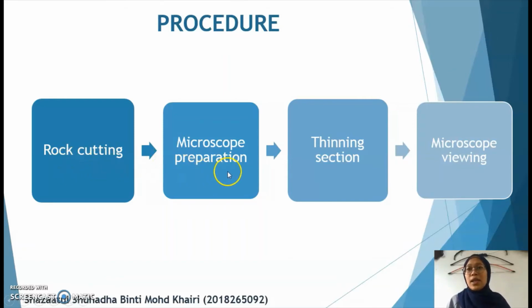And then the second one is preparation of the microscope slide. Basically the rock sample was applied onto the microscope slide, whereby the microscope slide had been heated and thermoplastic cement was applied onto it. This is to make sure that the rock sample sticks to the microscope slide.